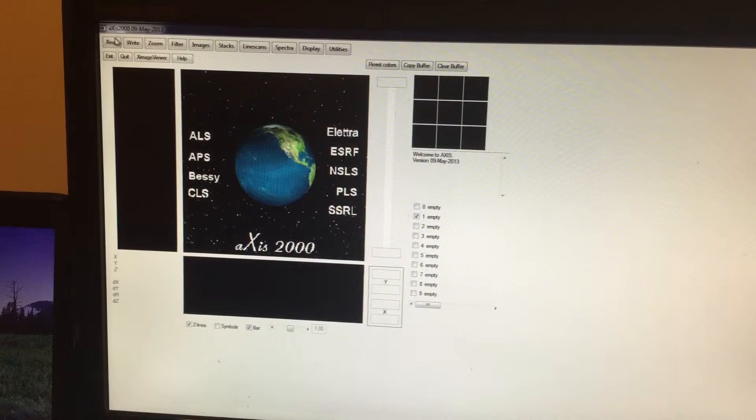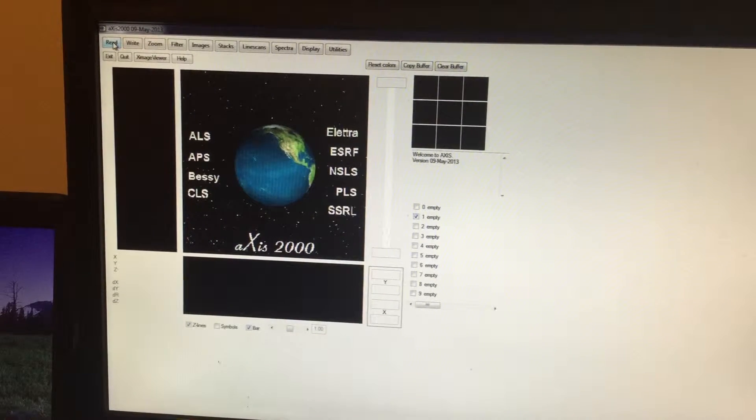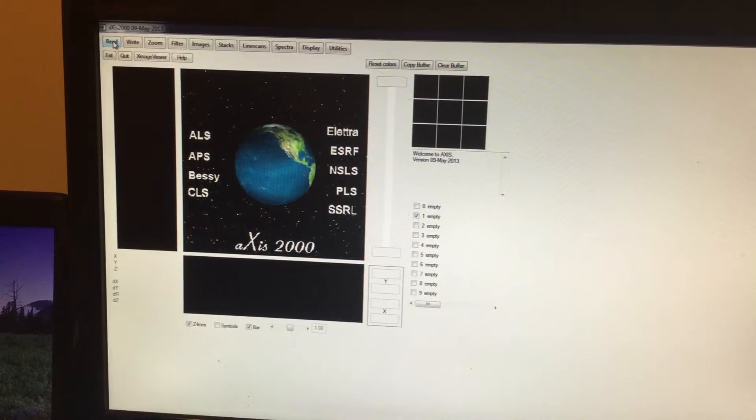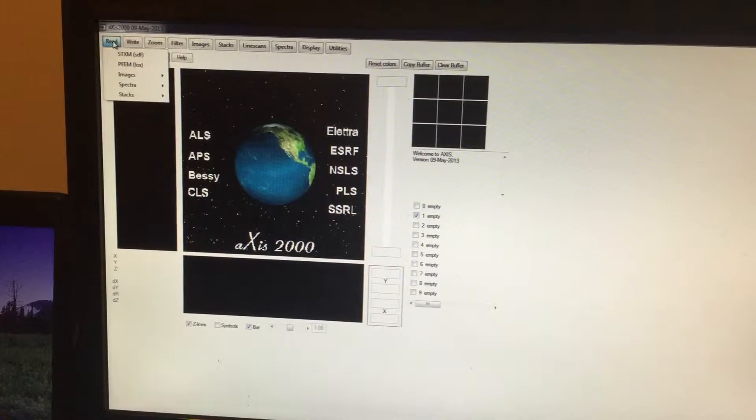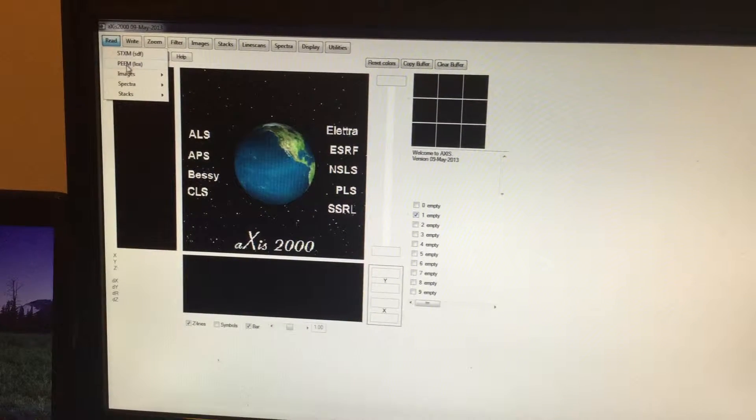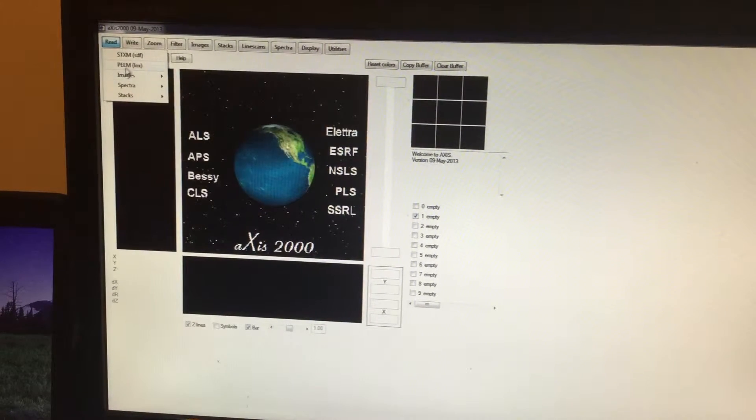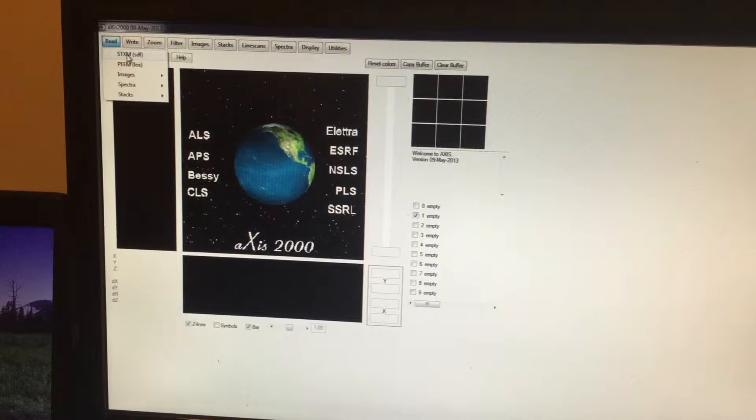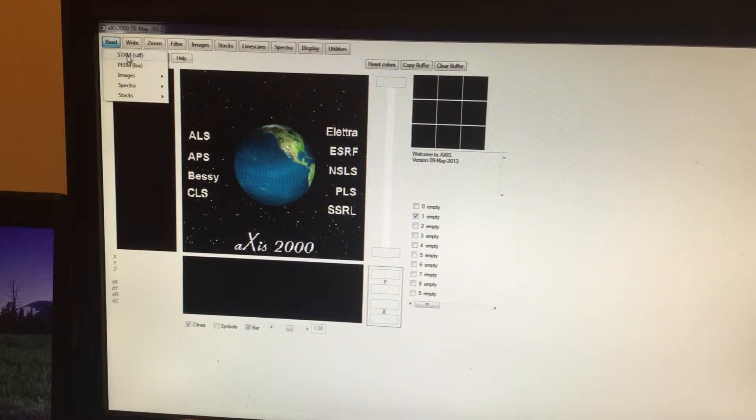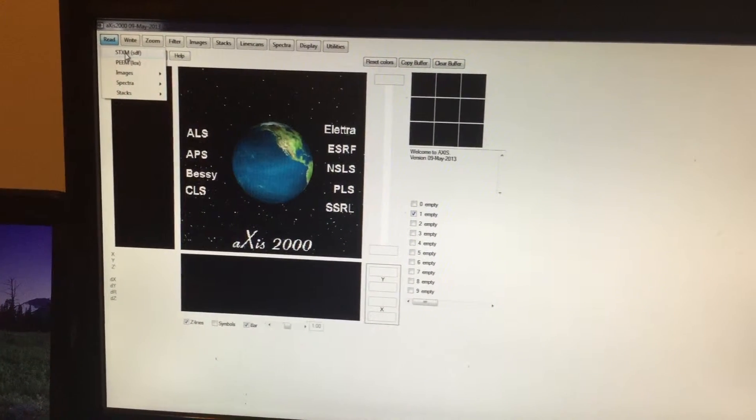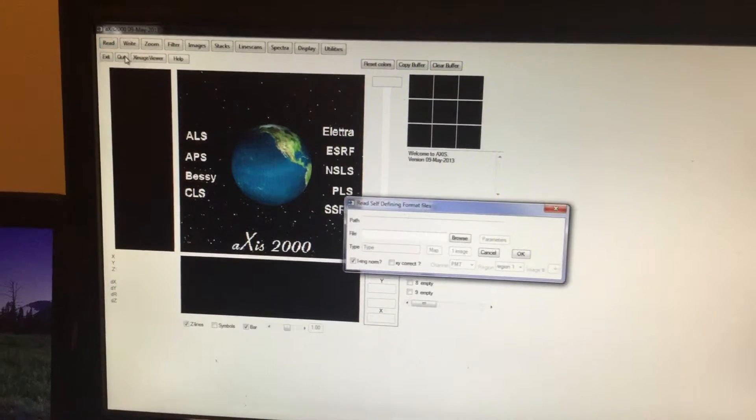In the first step, you're going to click on Read to load the data. You can see a number of options here: STICSUM, beam images, etc. But we are interested in STICSUM data analysis, so you're going to click on STICSUM.